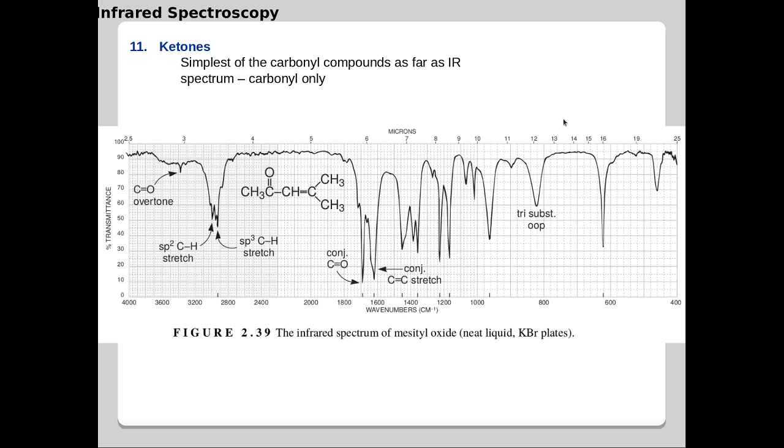Okay, so this spectrum shows the IR spectrum of a carbonyl carbon which is bound to a C=C, a vinyl type bond here. And as you know, for such a system the carbonyl stretching frequency is observed at around 1700 centimeter inverse, and this reduction in the frequency of the carbonyl functional group is due to the conjugation between the carbonyl functional group and the vinyl double bond here.